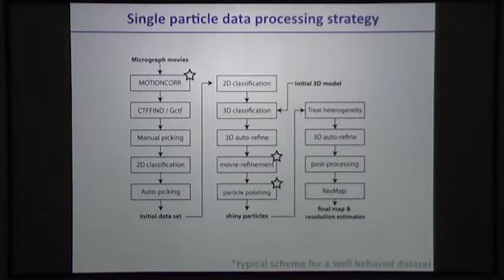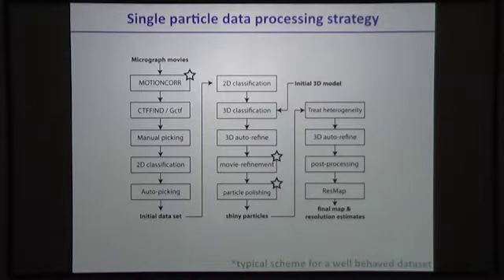This will be a typical overview of all the different steps that you should follow in order to go from the micrographs to the final map, and then go into interpretation of the map. I'll try to go through the different steps in a more practical way. At the beginning, we'll look at the initial processing, which will involve correction of movement and correction of the CTF, manual picking of particles, initial 2D classification, and later we'll talk about generation of an initial model, 3D classification, and auto-refinement.